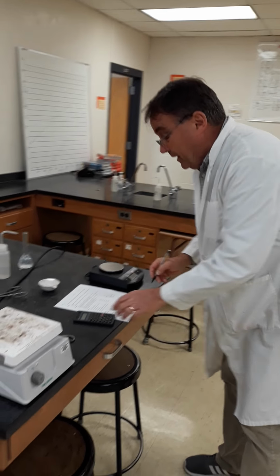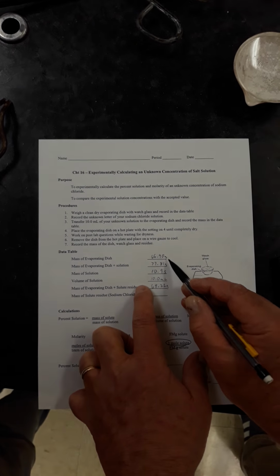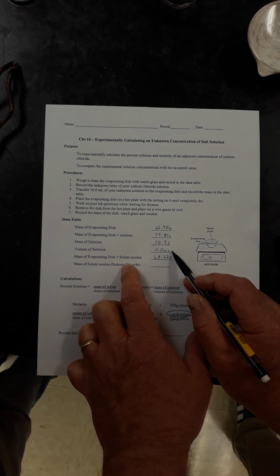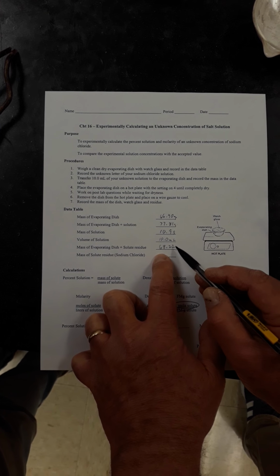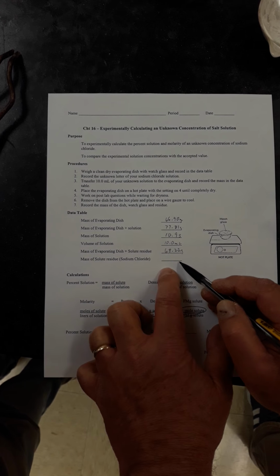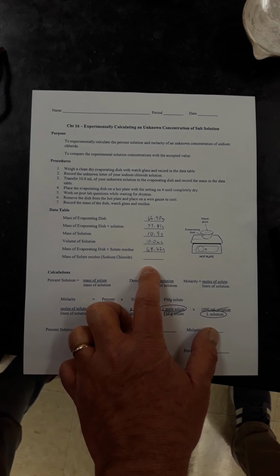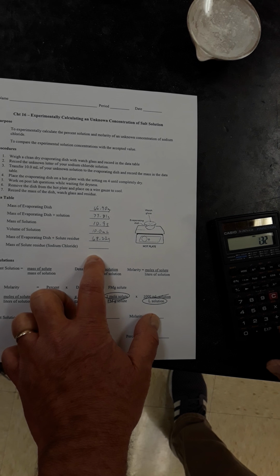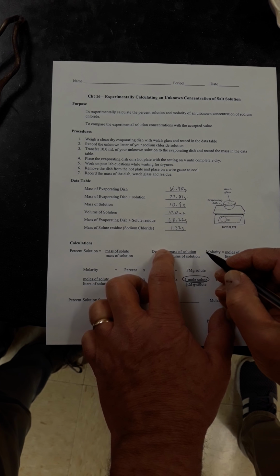Okay, so now if we zoom in, we can do the calculations. We subtract these two and get the mass of the solution. We know we used exactly 10 mils of solution. So if we subtract these two, we get the mass of solute residue. So 68.22 minus 66.90 is 1.32 grams of solute.